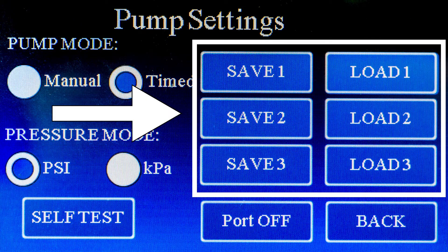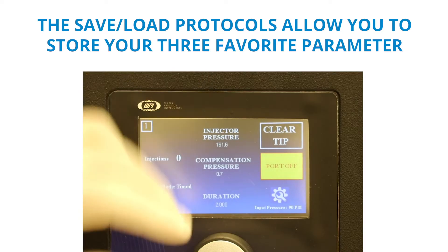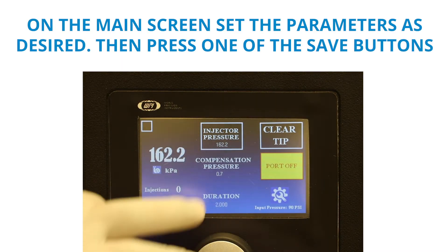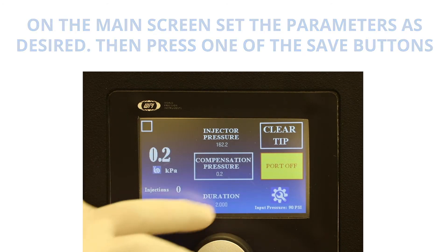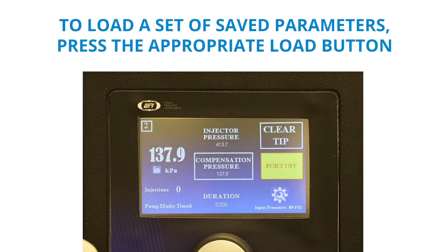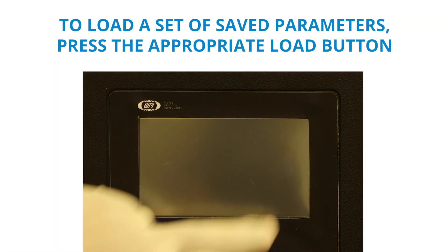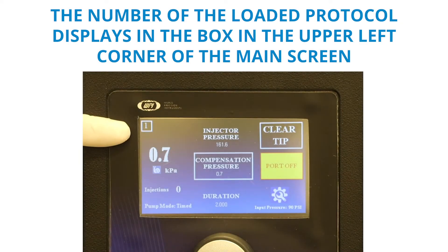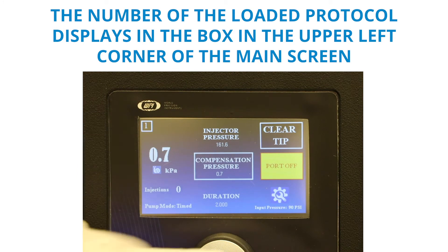The save/load protocol allows you to store three favorite parameter sets, or protocols. On the main screen, set the parameters as desired, then press one of the save buttons. For example, press save one to save the parameters as protocol one. To load a set of saved parameters, press the appropriate load button. The number of the loaded protocol displays in the box in the upper left corner of the main screen.